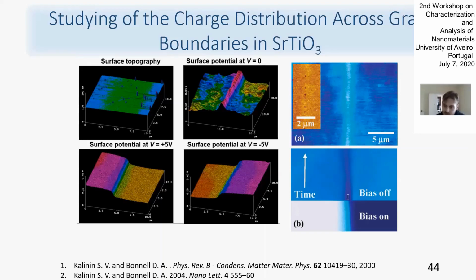And which is also important, if you scan this area in contact mode with applied DC voltage, you can modify the electrical properties, and thus you can study how the relaxation of the screening process by the mobile charge is organized in this system.